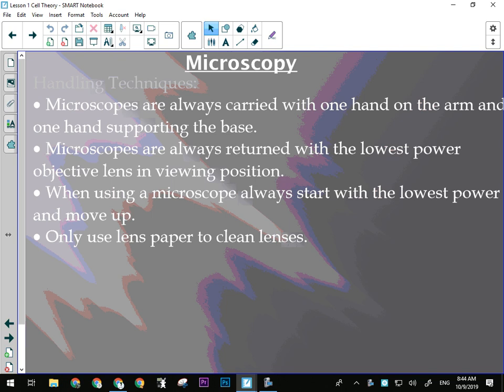Okay, so tomorrow we will be going into the lab and using the microscopes to look at some things, getting the hang of how the microscope works, getting the hang of how to take pictures through the microscope with your phone, because that's how you're going to do your lab diagrams. Back in the day, people like me with zero artistic ability actually still had to draw lab drawings by hand, even though I sucked at it. I could get it super focused. I was good at the microscope, but I always did poorly on my lab drawings because I just couldn't draw.